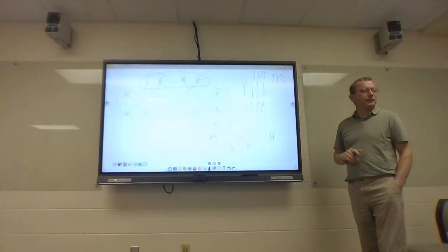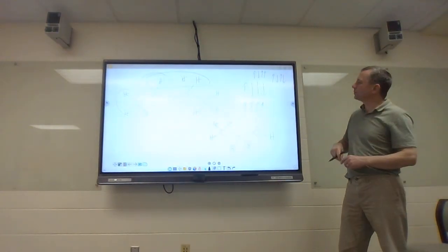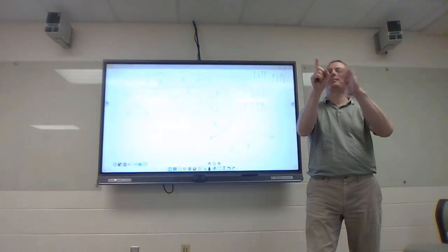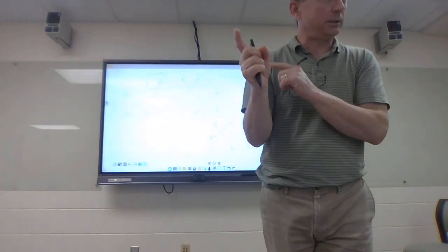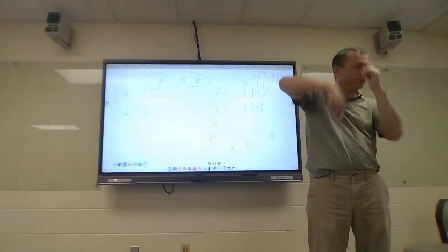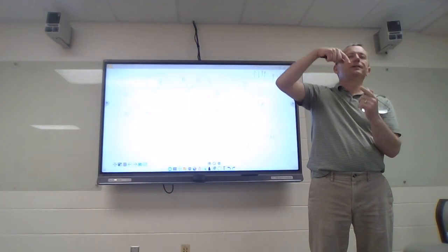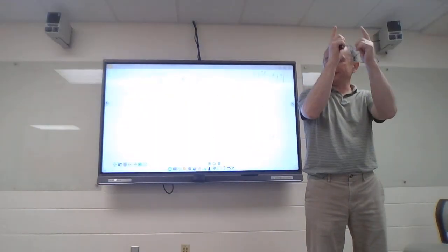like that, right? And again, I'm not doing it real well, but when you look at the probability of how these spins align or misalign, the misalignment is going to be essentially pulling your magnetic field in the opposite direction, versus when it's aligning, it's enhancing it.